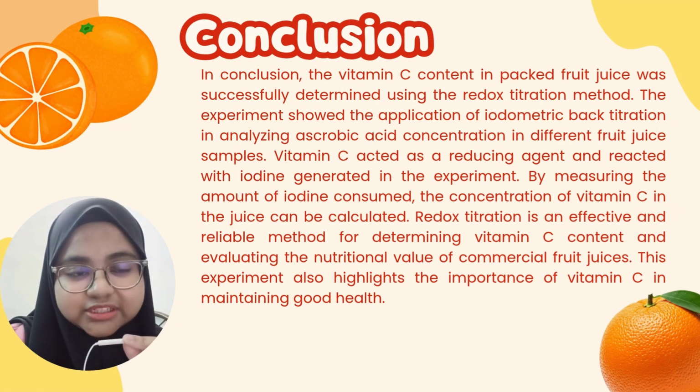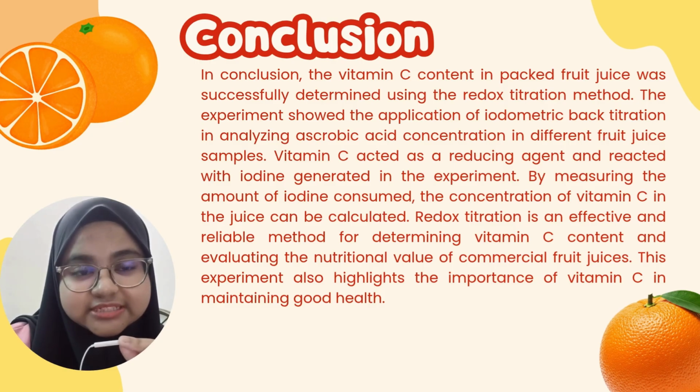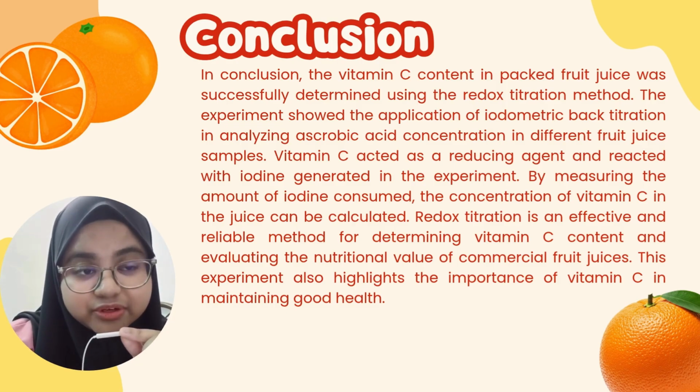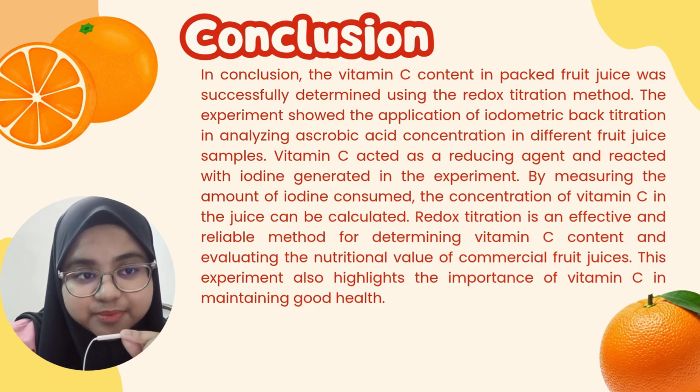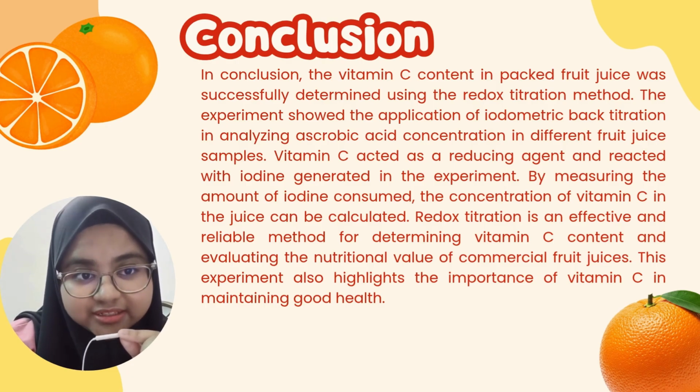In conclusion, the vitamin C content in packed fruit juice was successfully determined using the redox titration method. The experiment showed the application of iodometric back titration in analyzing ascorbic acid concentration in different fruit juice samples. Vitamin C acted as a reducing agent and reacted with iodine generated in the experiment. By measuring the amount of iodine consumed, the concentration of vitamin C in the juice can be calculated.